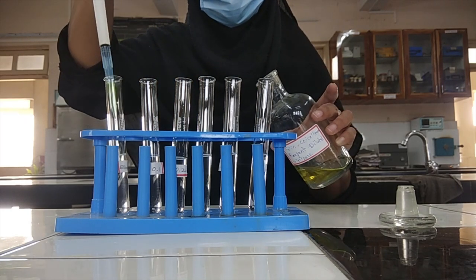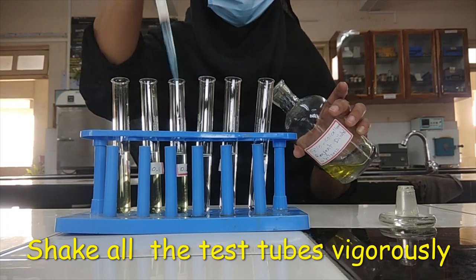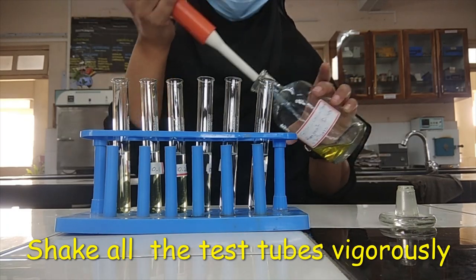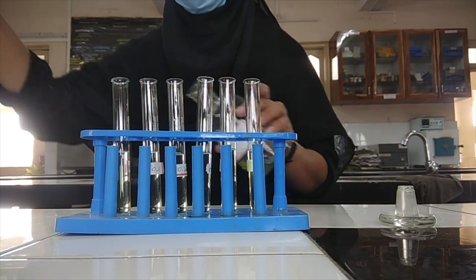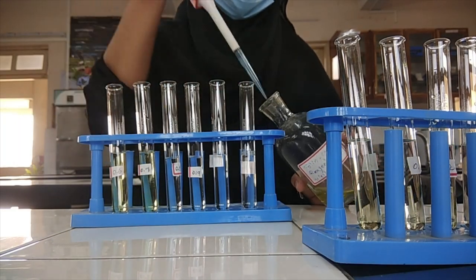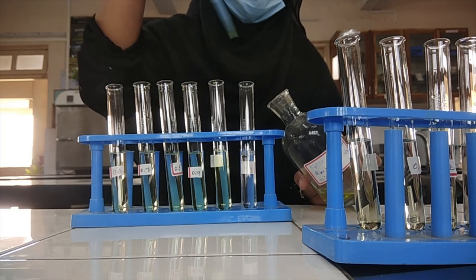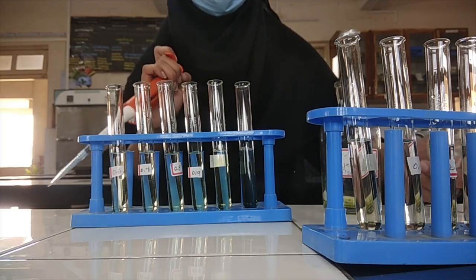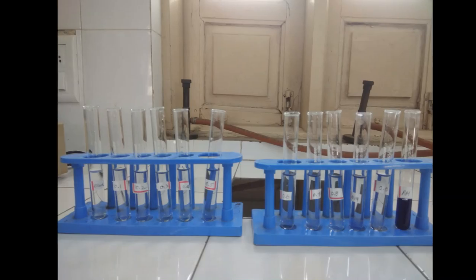After standby, add 0.5 ml of Folin's reagent in each test tube and shake the test tubes vigorously. Now let the setup stand for 20 minutes at room temperature.